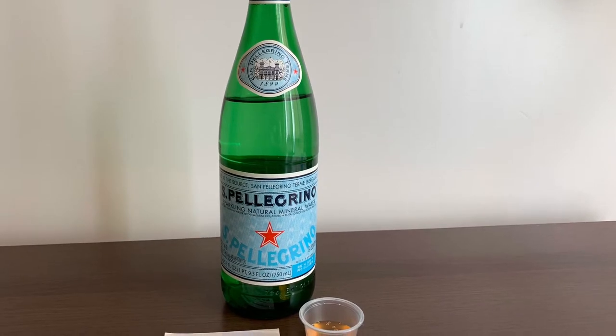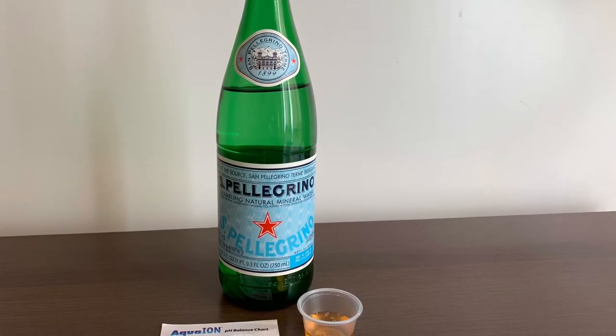Now let's check the pH reading. The pH is around 7. The TDS and pH are both good — it is perfect. Thank you.